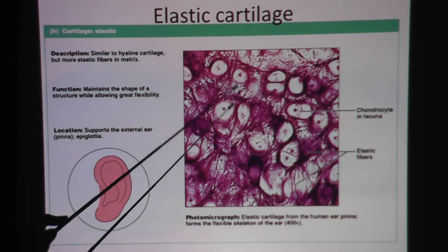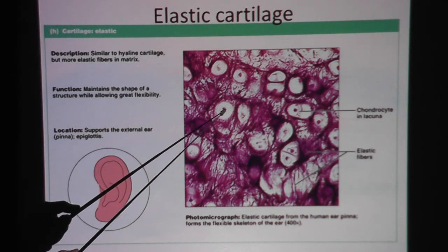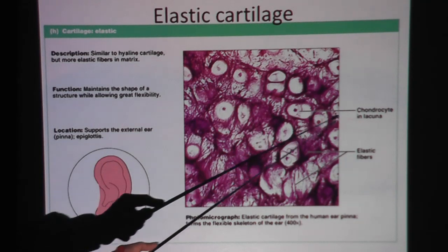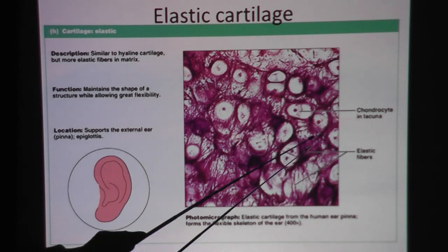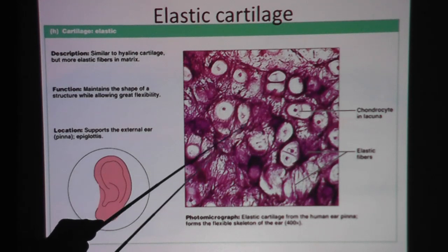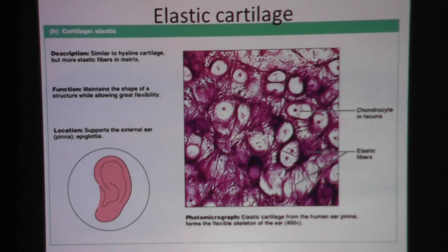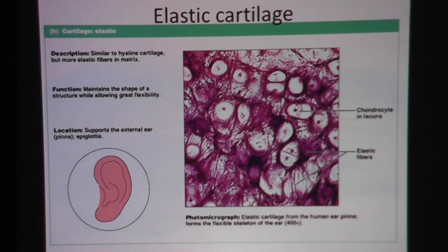These are chondrocytes in lacuna. Chondrocytes means that they are cells in cartilage, because 'chondro' means cartilage and 'cyte' means cell. These chondrocytes live in a little space called lacuna. If you look at these cells, there's a little bit of a white space around them — that would be the lacuna. You can think of it in the Spanish version: lacuna means crib, so the chondrocyte can be like a little baby lying in the crib called lacuna.